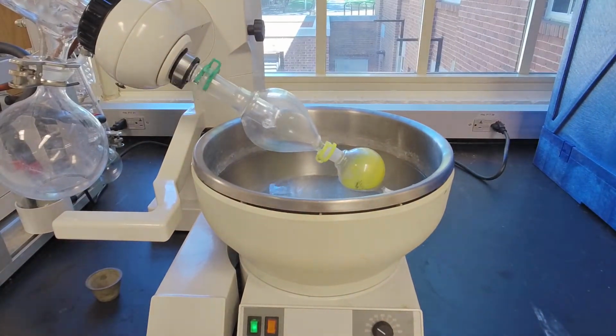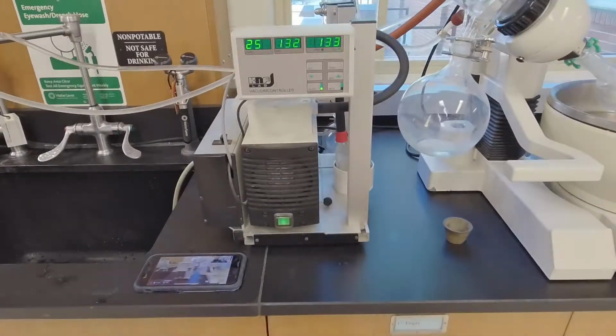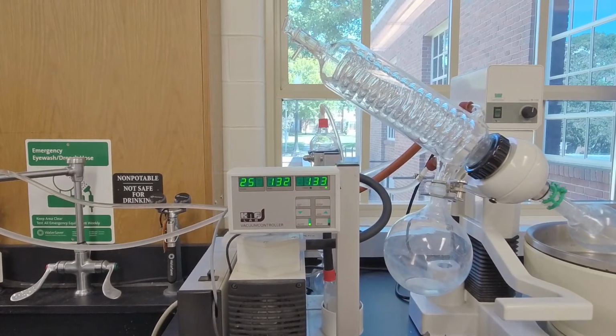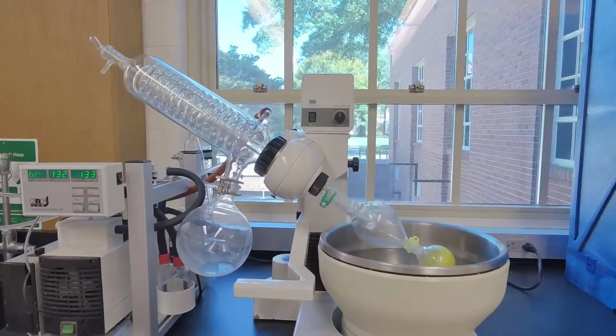And so what I would recommend is just leave it for another couple of minutes. I always do this. Once you think it's done, leave it for a couple of minutes. In a research lab, the next step to this would be to apply what we call a high vacuum. So right now we're at about 130, about 140 torr. That's not a real high vacuum.